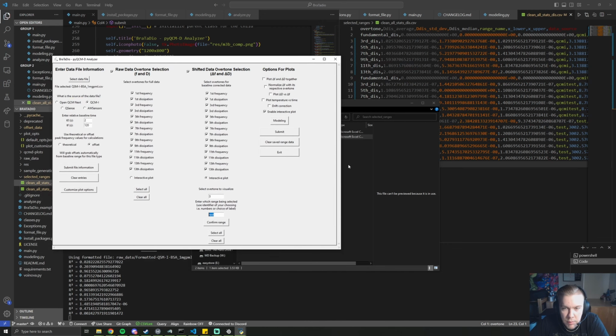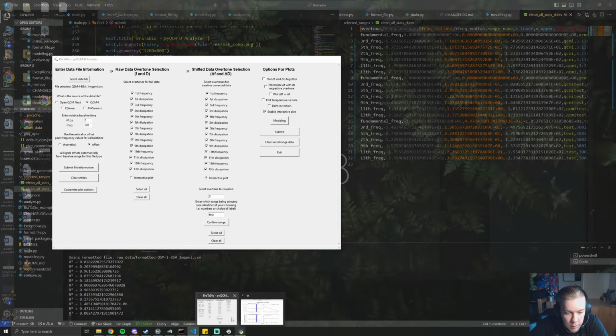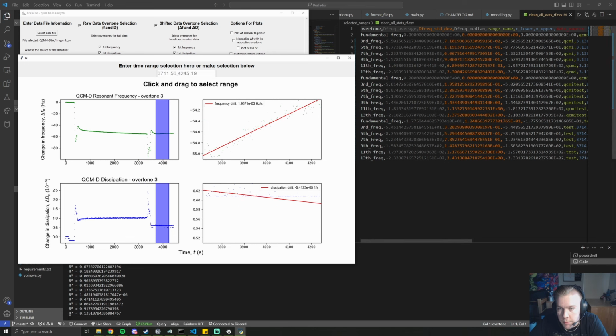So let's go ahead and close this, and I'm going to show this next part in my code editor because it live updates instead of having to open and close the file over and over again. So we're going to open these back up. You can see here we have test in the green column here. These are what the values are. It might not change very much, but you can see it will update. Values are different now, again, just because it happens so fast.